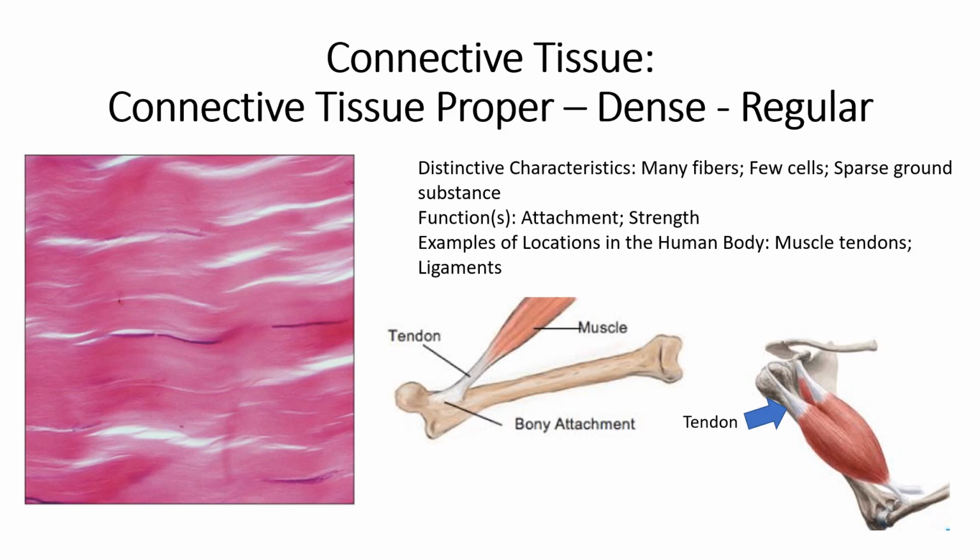Also, think about the pattern that you're seeing. It's like a fluid, regular pattern to those pink fibers, hence the name dense, regular connective tissue proper, right?